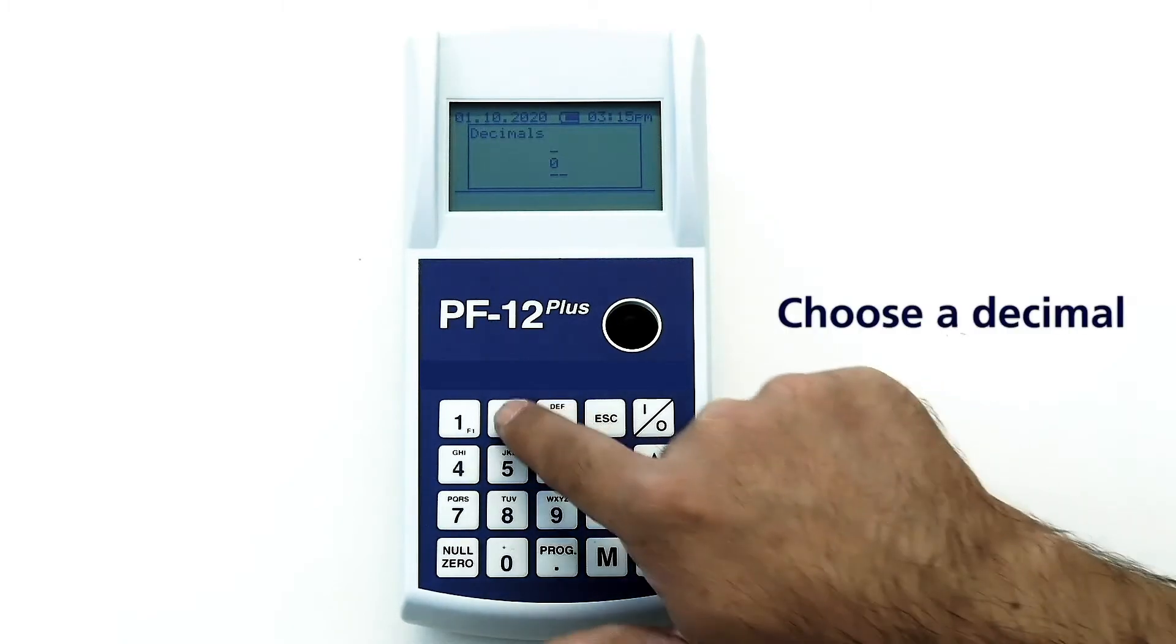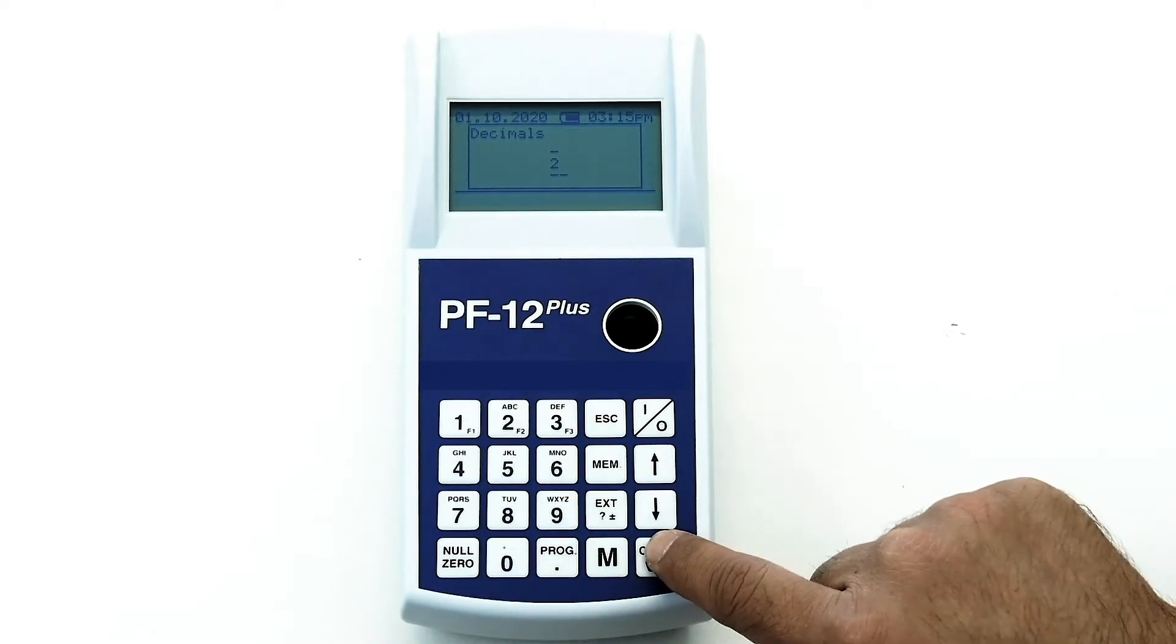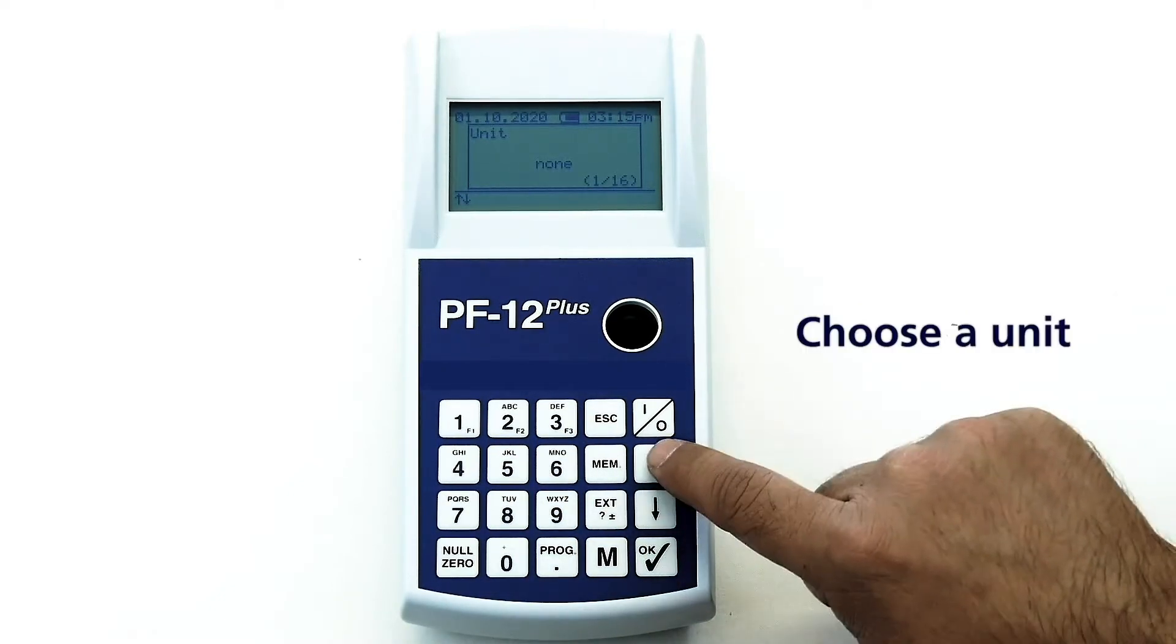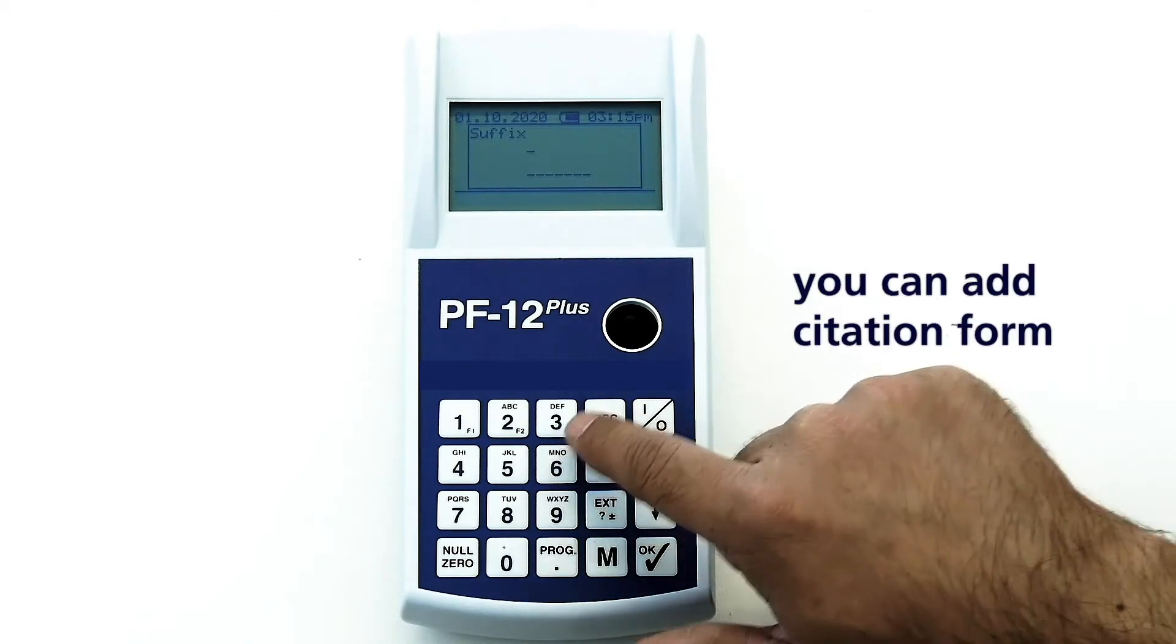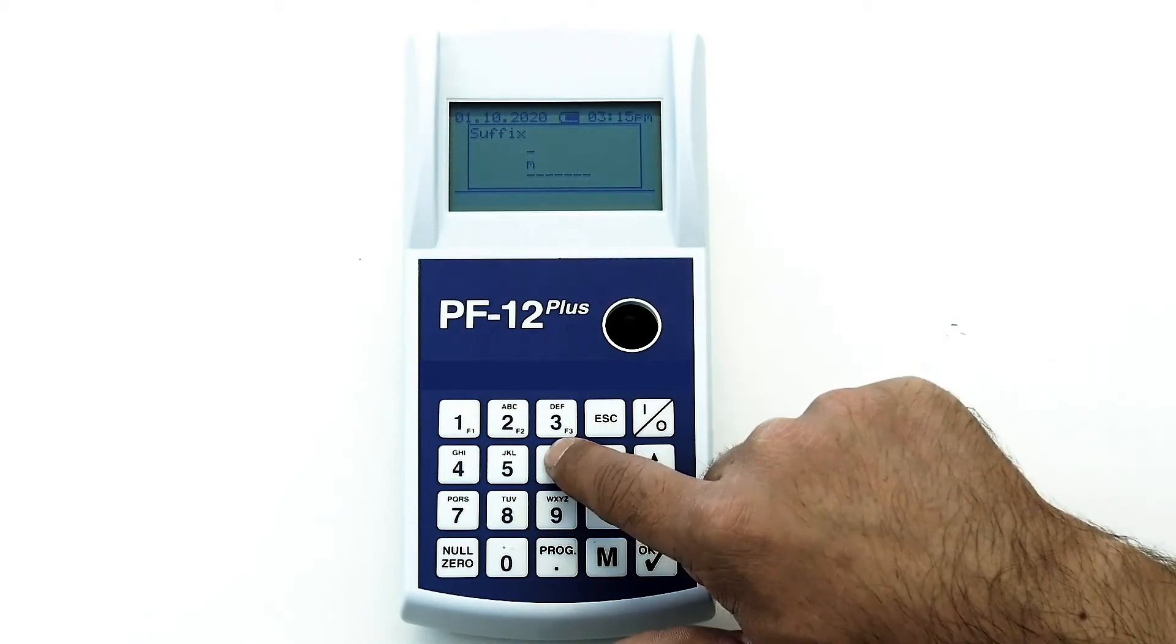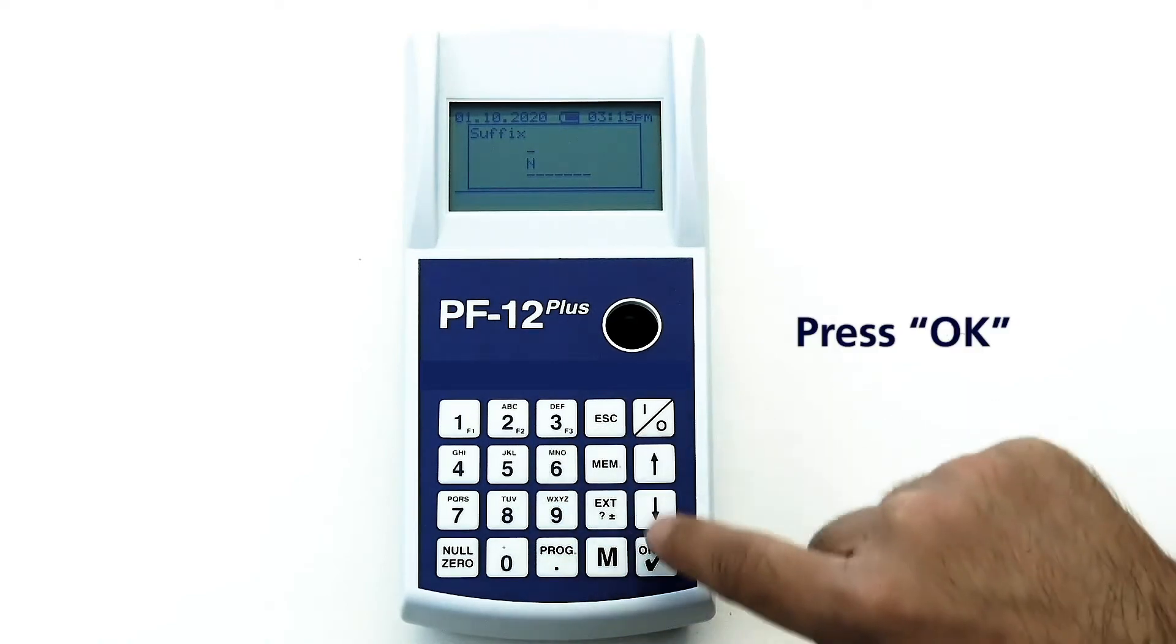Choose a decimal for this method. Choose a unit. Press OK. In suffix you can add the citation form for this method. Press OK.